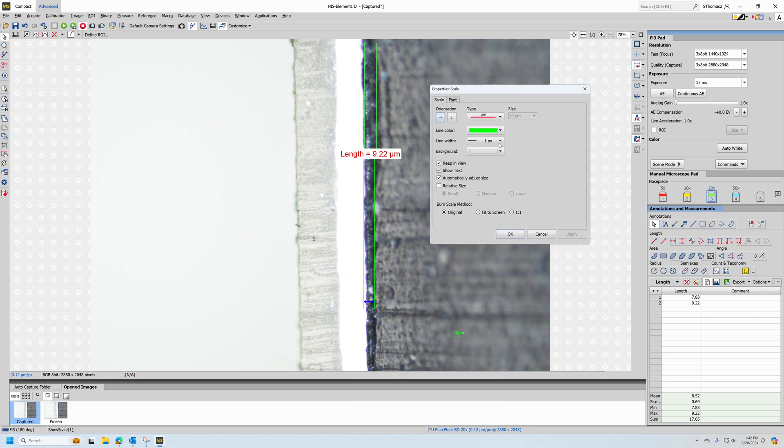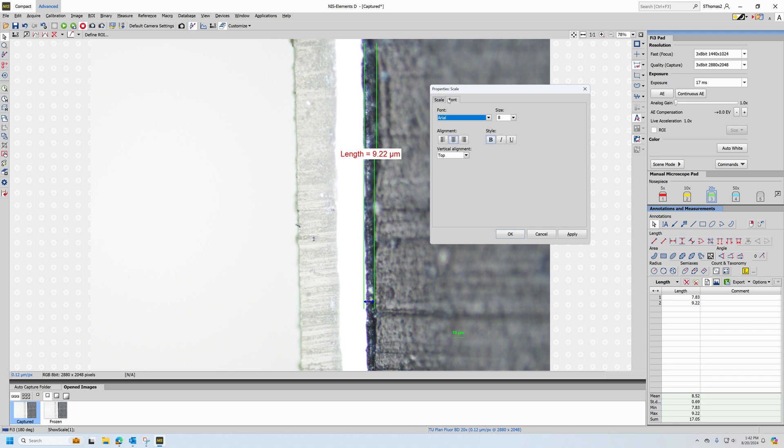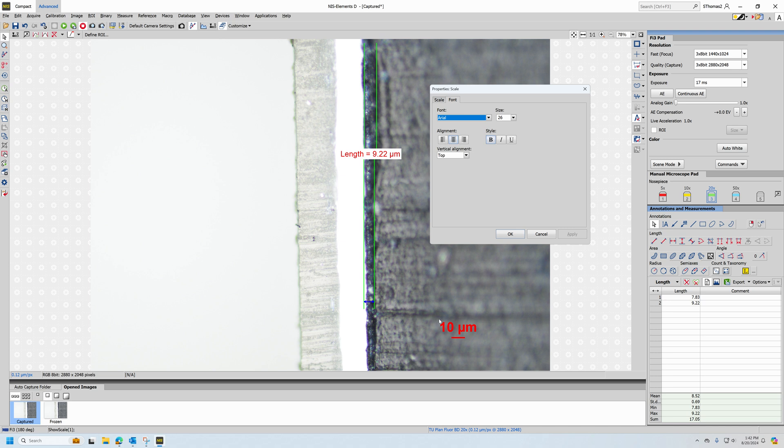Once the scale properties are open, I can adjust the line width, change the scale appearance color, and change the font size by clicking on the font tab and making that larger. I can see how those changes appear on the image by left clicking apply, and then see if I need to make any further adjustments.